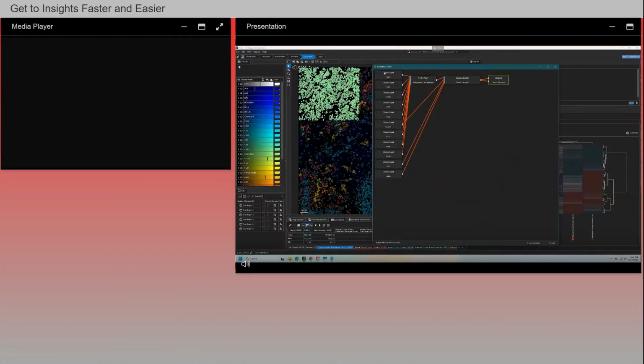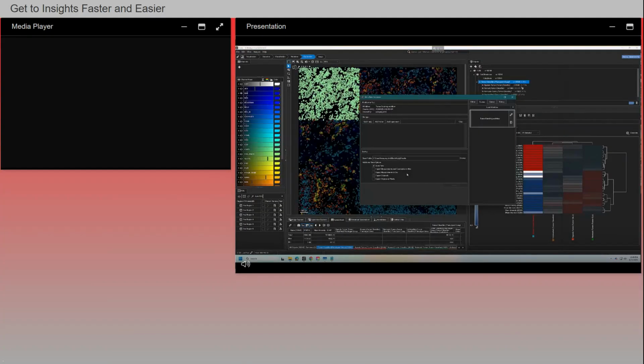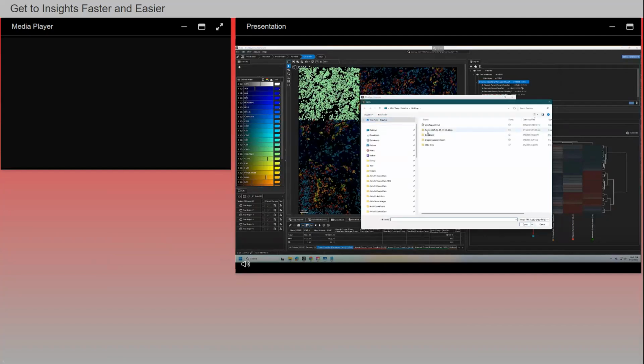So you could see there are channel inputs, recipe apply, and also different types of classifiers with all the details that you could see here. And when you select the relations, basically every step leading up to the relation analysis is batched automatically. In this example, I'm going to set up a batch process. What you need to do is specify which files need to be batched.